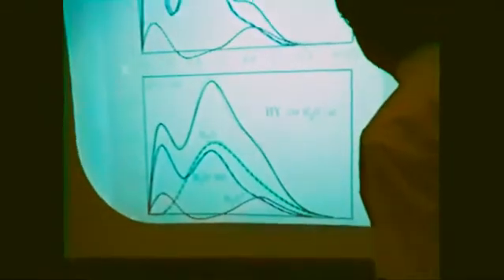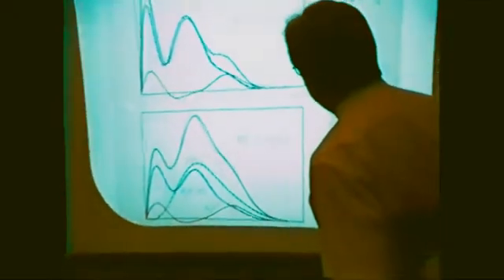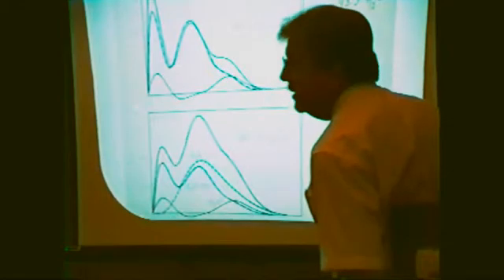OH group. And if you look at the shape of the signal, you see that they are really very different, and especially the position of maxima and minima are very different, which proves that it is rather easy to do the simulation of the spectrum.